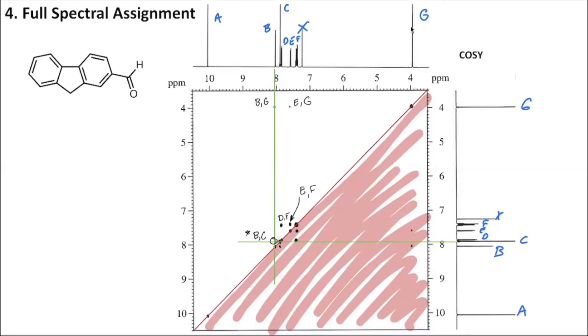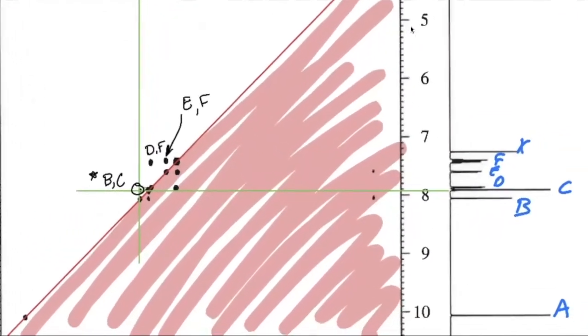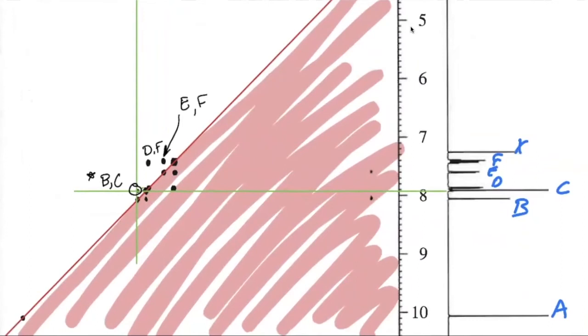So, prepare for a zoom. This may feel a little bit uncomfortable if you're sensitive to certain types of visual change. There we are. Now we're zoomed in a little bit closer so that we can start to see a little bit better the alignment on the side, C or D.